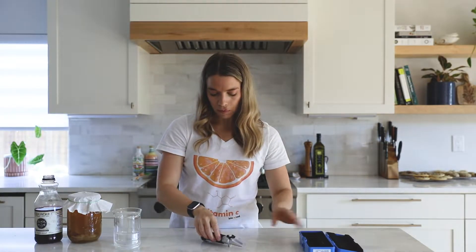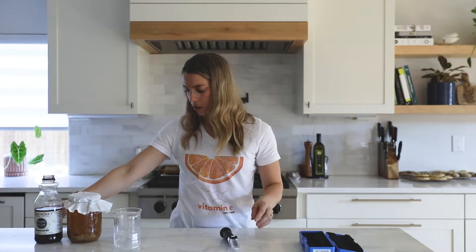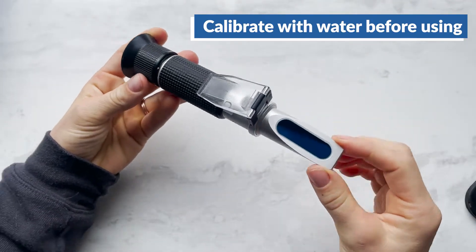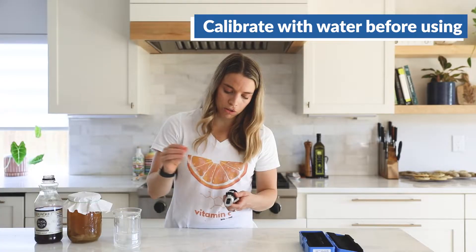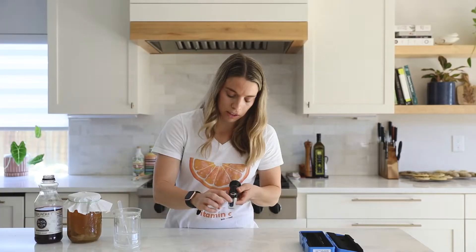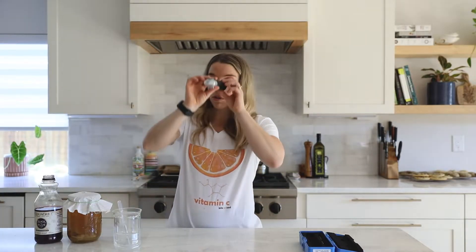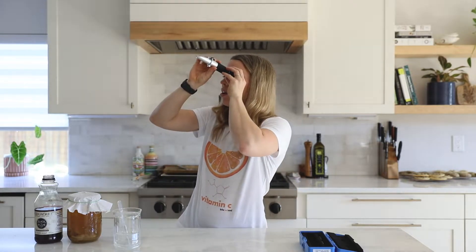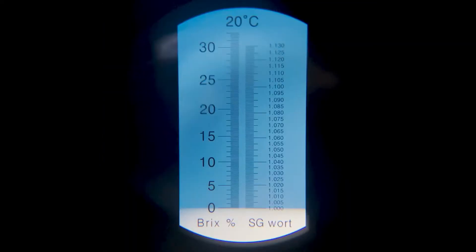To use this, the first thing you'll want to do is put water on it to make sure it's calibrated. Just put one or two drops on here and cover it. You'll notice it starts sealing, and then you'll look through the eyepiece — you'll want to be somewhere with some light, looking up towards a light source. This is currently at zero, so it is calibrated.